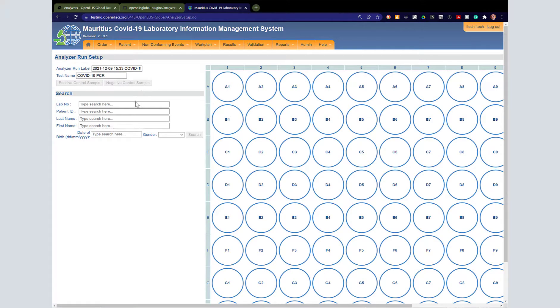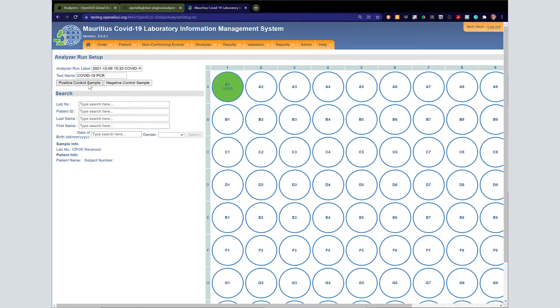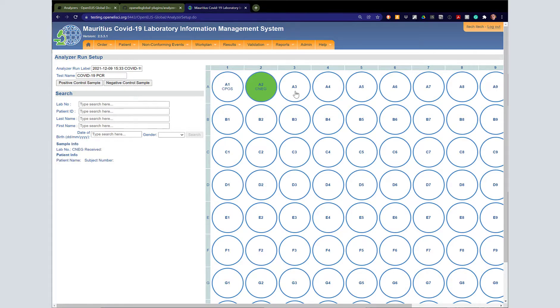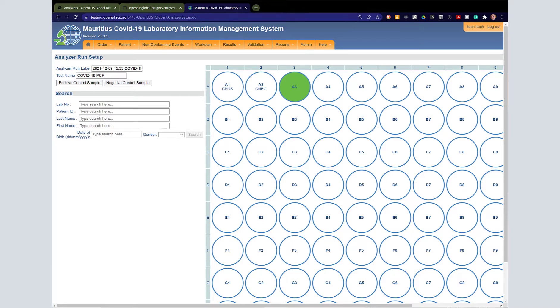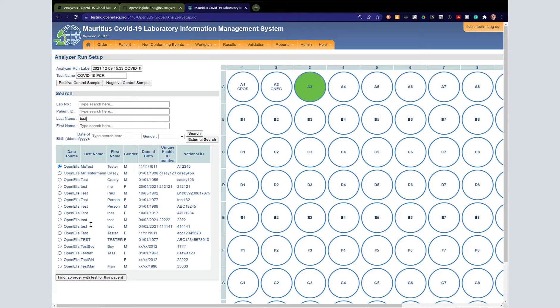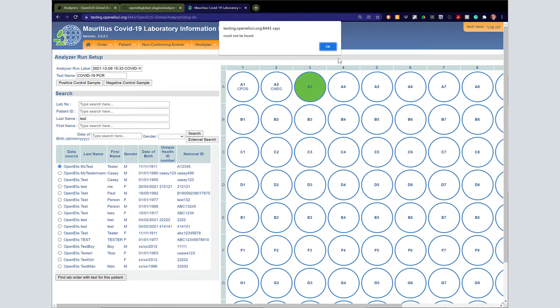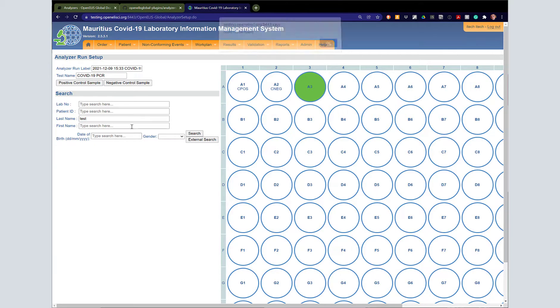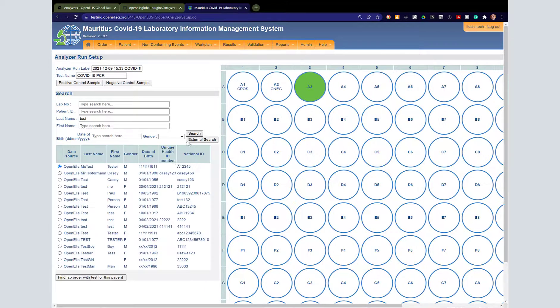The only test right now that it's configured for is COVID-19 PCR. We can set positive and negative control samples through this interface, and you can see this is the entire plate. Then we can search for COVID-19 tests either by first and last name or by searching with the lab number.